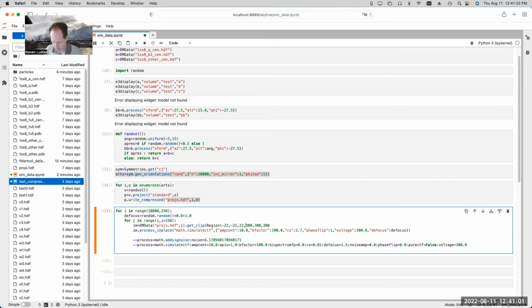Now, actually, sorry, these are 2D, not 3D. So just variables like that. So region allows you to specify either 2D or 3D regions. If you're specifying a 2D region, this is the X and Y starting location, and this is the size of the resulting box. So if you want to pad something that's 256 by 256 and put it in a 300 by 300 box, you have to shift the origin past the origin, sort of outside the box, and then you specify a bigger box size, and you want to make sure that the size in the lower left is the same as the size in the upper right. So it's 300 minus 256 divided by 2, which are the negative numbers that you see right there. Hope that makes sense.